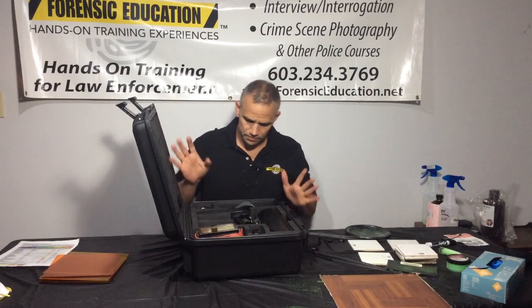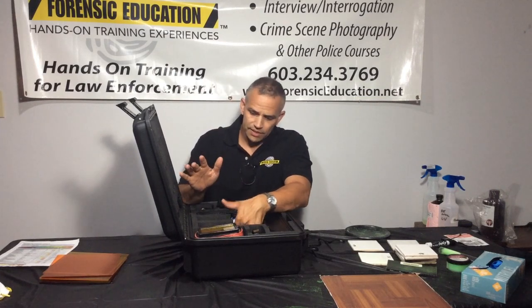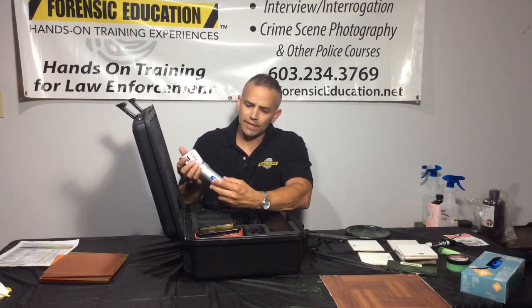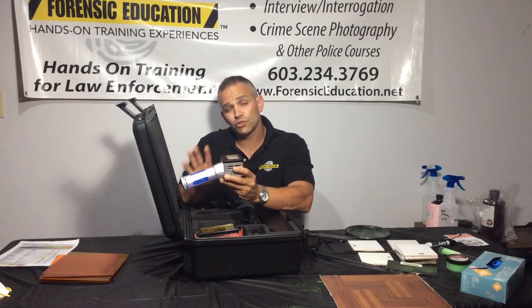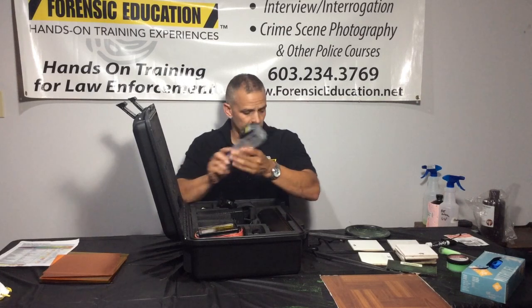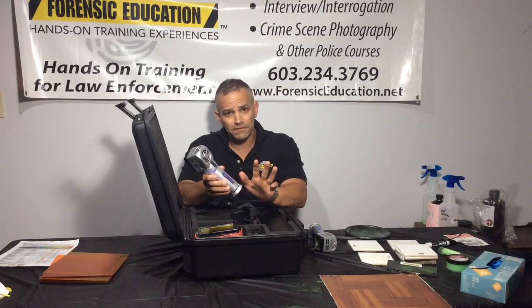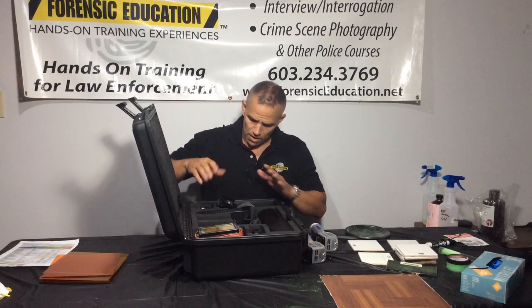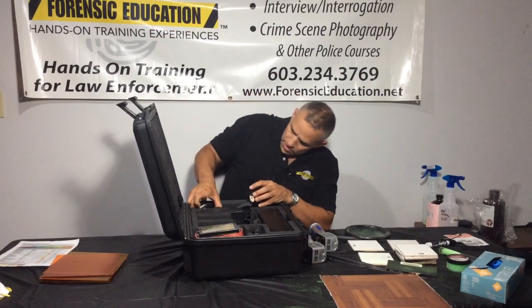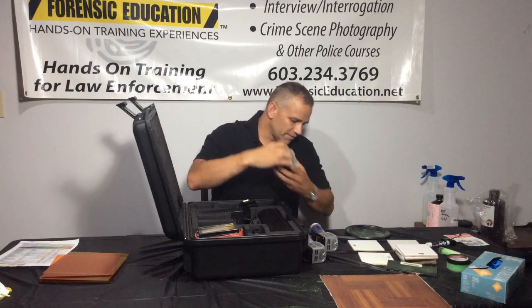This pack actually has three lights in it. It has a blue light going between 420 and 470 nanometers. This one's a UV light, going between 350 and 380 nanometers. These things are so strong — they run off of an 18-volt battery. I'm telling you, you're going to love this.